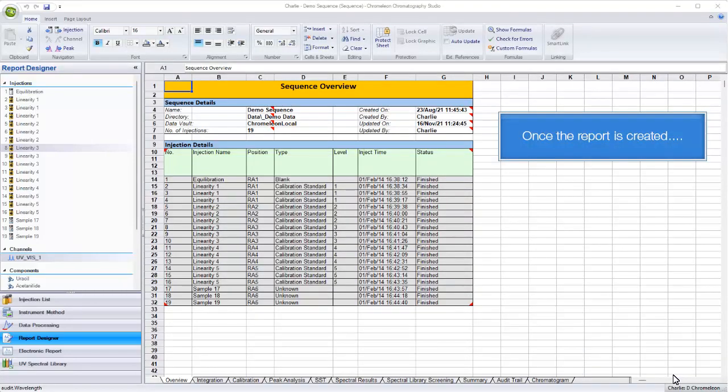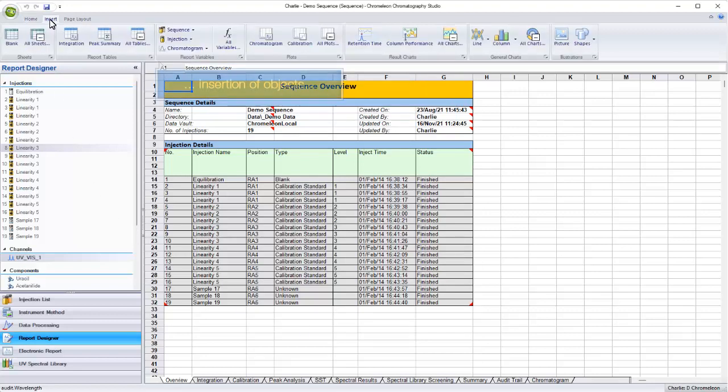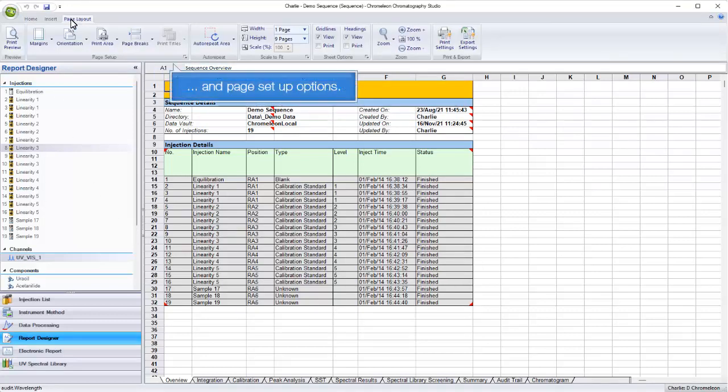Once the report is created, the report designer provides ribbons including formatting options, insertion of objects, and page setup options.